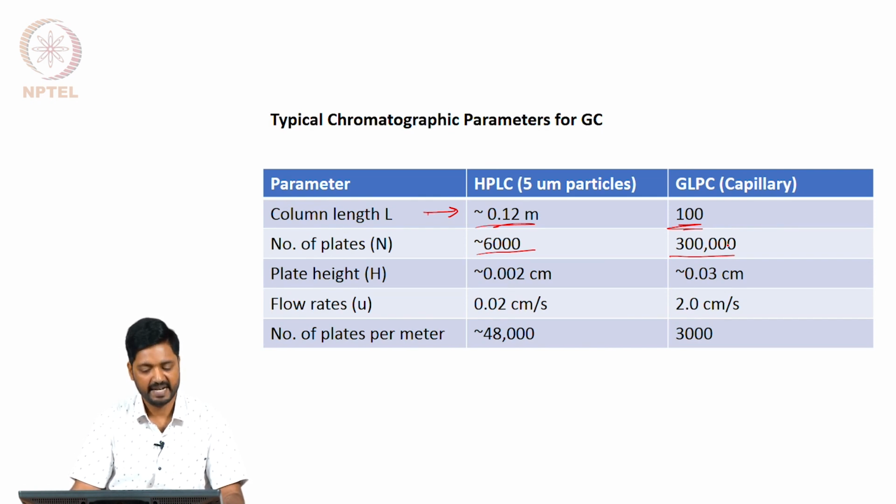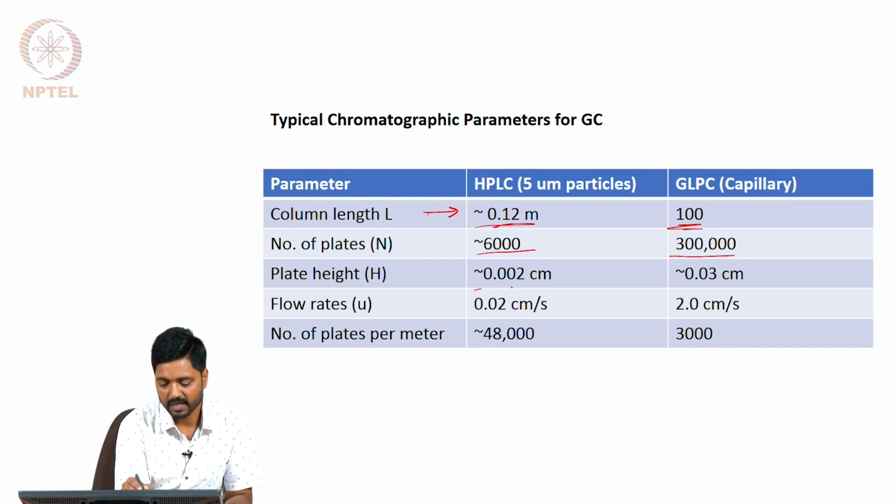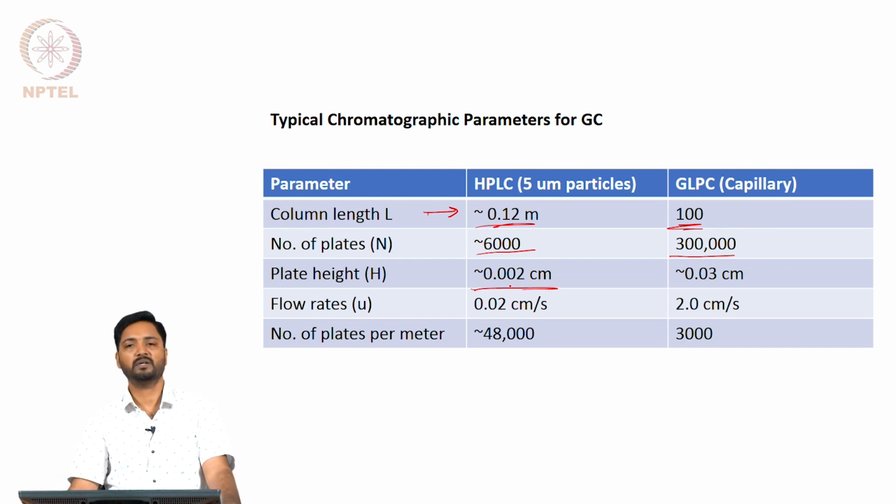Now, the plate height, which indicates the efficiency of separation, is of course much shorter in the liquid chromatography system, because the mobile phase is a dense phase.